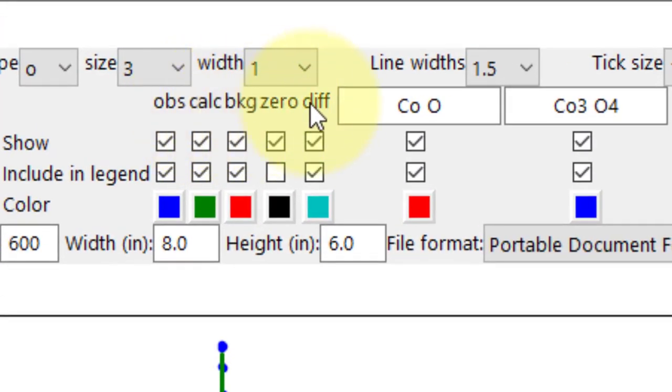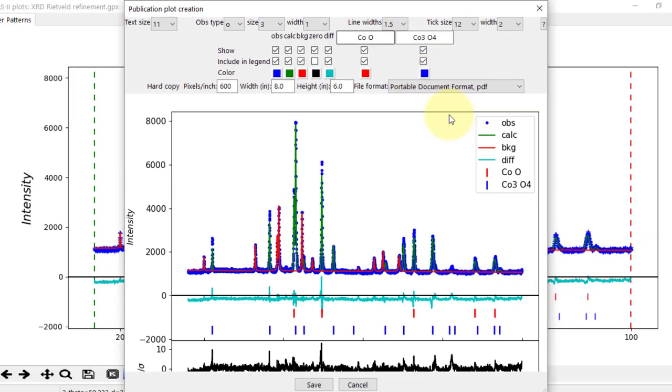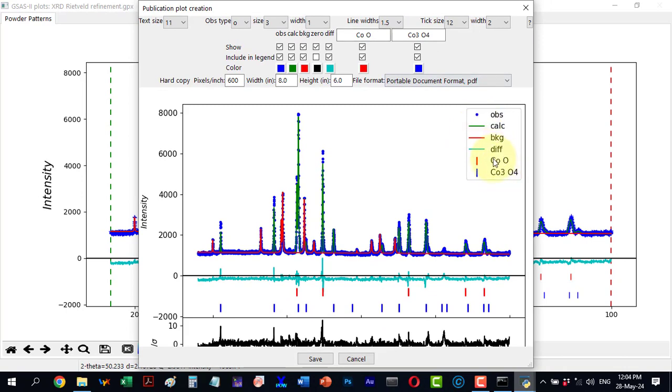Next we have the phases which are CoO and Co3O4. I can change their names in the legend or adjust the spacing between them.